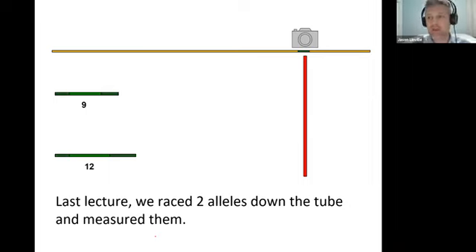So we have DNA from Dr. Linville. We have my DNA in the tube. And we're going to set up a reaction with dNTPs, same for everybody, polymerase, same for everybody. And then also I'm going to pull primers that I ordered that are going to amplify TPOX. We'll say TPOX or whatever, 1 locus.